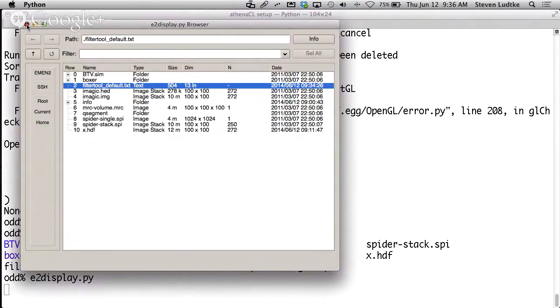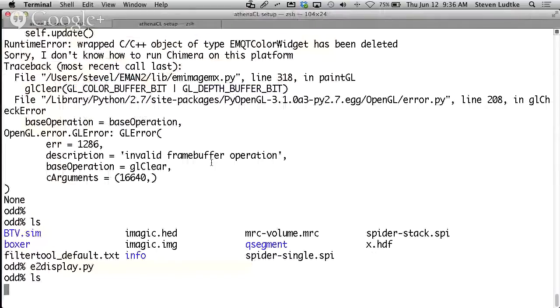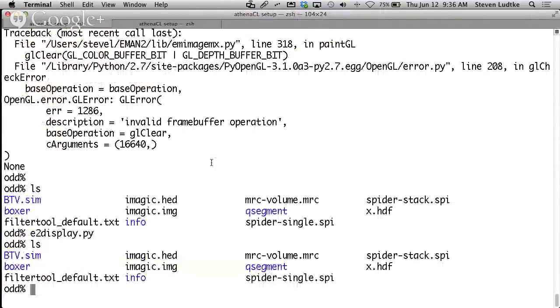All right. The generic image processing commands in EMAN2 are e2proc2d and e2proc3d. One is obviously for volume data, and the other is obviously for 2D data. So let's say I want to apply that exact sequence of processors to a set of 2D images.